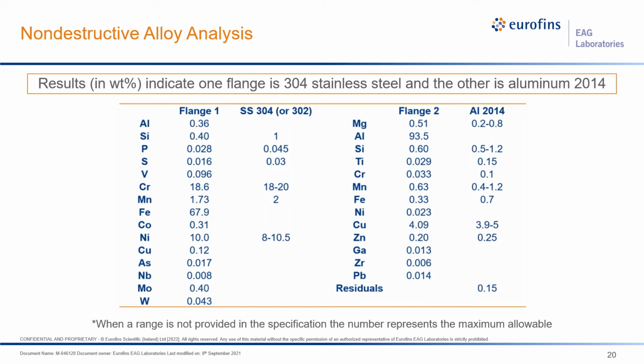We routinely identify or verify compositions of many types of alloys, including unambiguously distinguishing between most 300 series stainless steels, except as noted above. Since we aren't a lab supporting a small number of specific materials, it isn't possible to have standards for all of the possible materials we're asked to analyze. We therefore often rely on the fundamental parameters method. However, I'll point out that we do have many alloy and glass standards available, and when the need arises, we've also purchased additional reference materials to support specific projects.